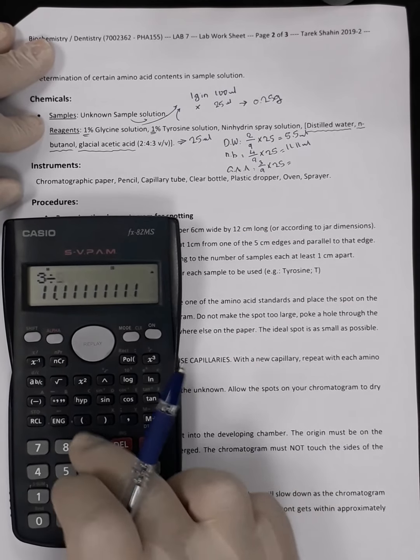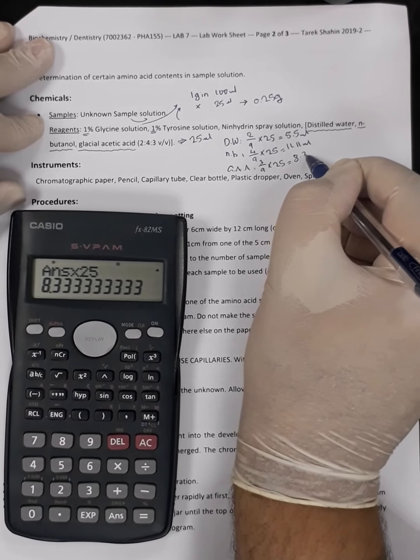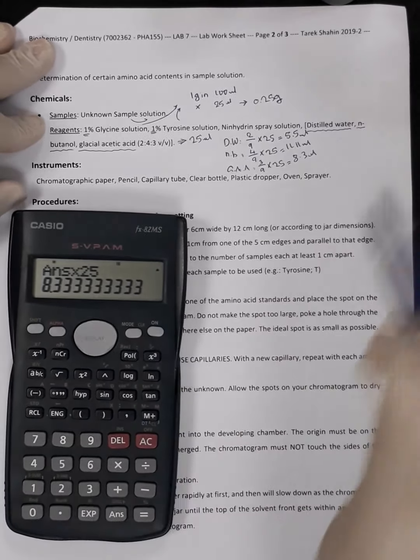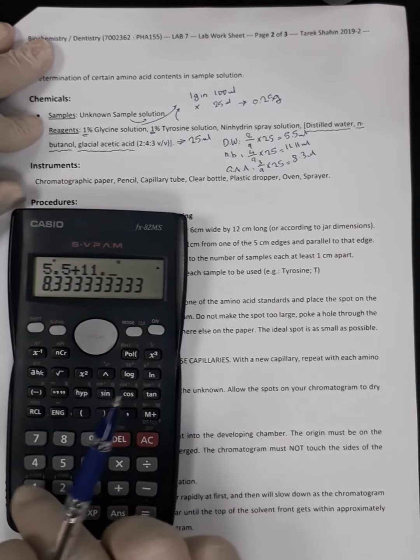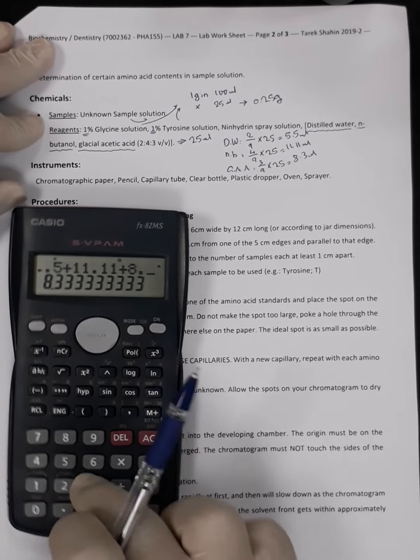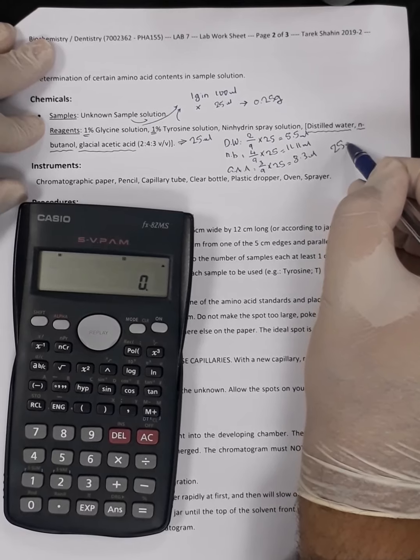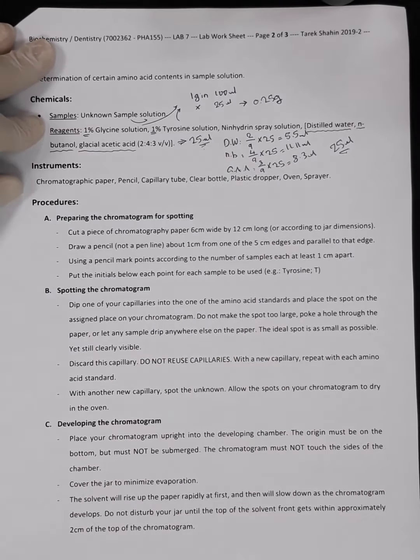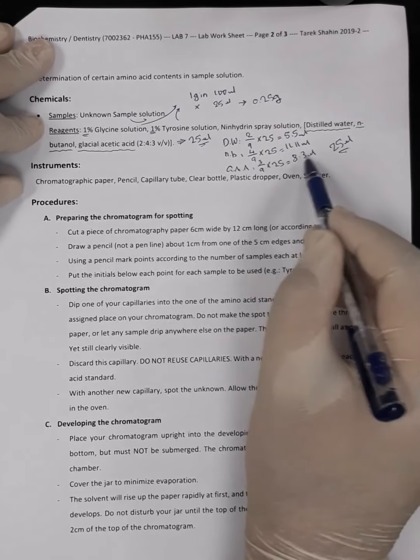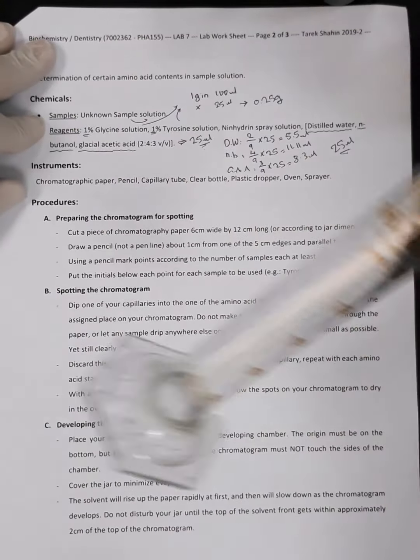So 3 divided by 9 multiplied by 25. So it is 8.3 milliliter. Of course, if we add all of them, 5.5 plus 11.11 plus 8.3, the total volume would be around 25 ml, which is the total volume we required to prepare from the beginning. Okay, so this is how we prepare the mobile phase, the mixture of the mobile phase. Of course, we have to use the measuring cylinder in that procedure.